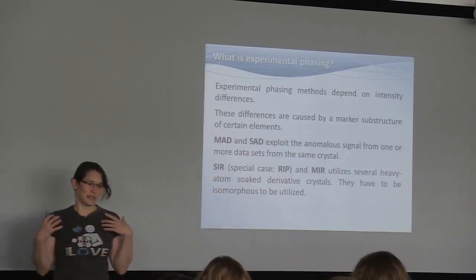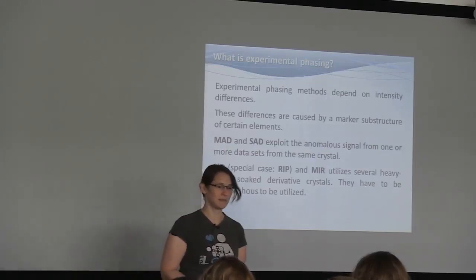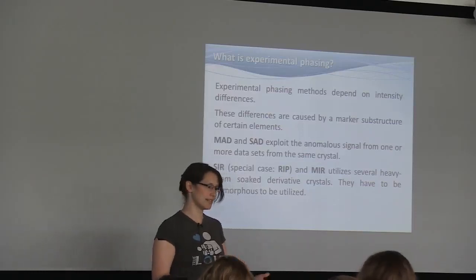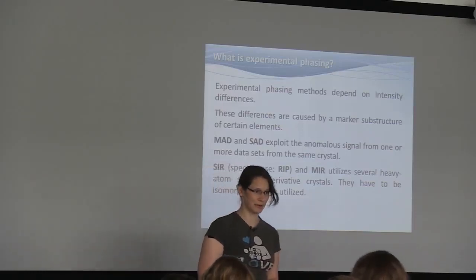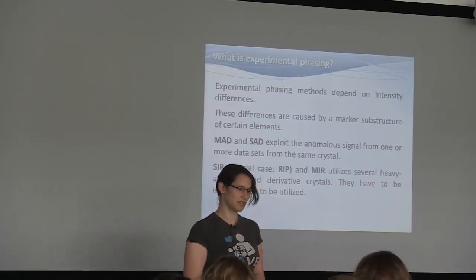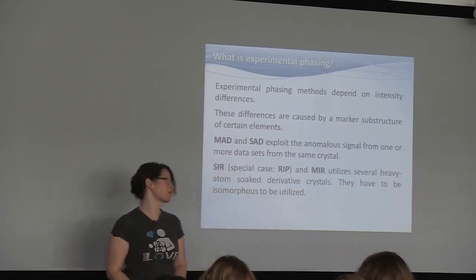Now, the first question is, what is experimental phasing? A few years back, I did a survey in Randy Read's lab, and I went around and asked everyone about what is experimental phasing. And I think the best answer I got was from a PhD student in his first year who said, experimental phasing is what you do if MR doesn't work. That's often true.